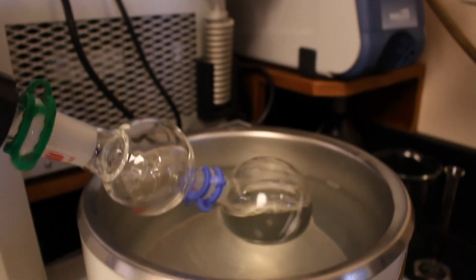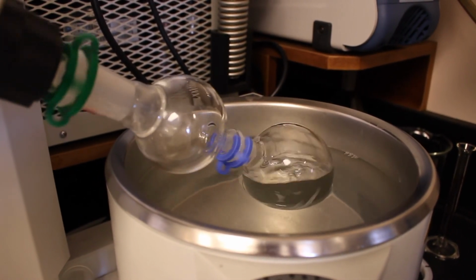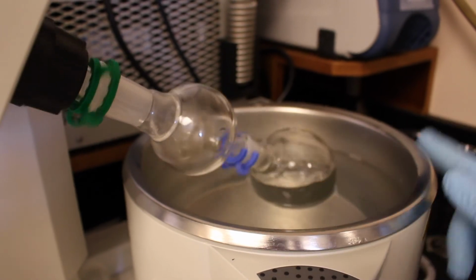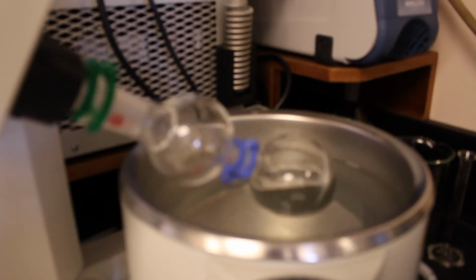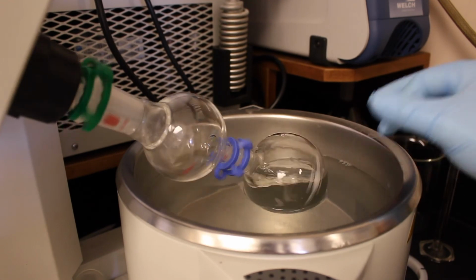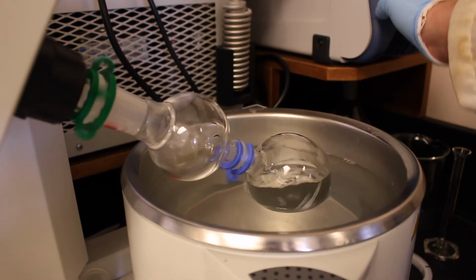Okay, we can increase the vacuum a little bit. And already you can see some of the vapor is making its way up the bump trap. And this is kind of remarkable. So the boiling point of dichloromethane is around 40 degrees Celsius, but the temperature of the water bath is somewhere around room temperature. It's probably no more than 30 or 35 degrees Celsius. And the way we're able to boil the DCM or remove the DCM below its boiling point is because this vacuum pump reduces the external pressure.